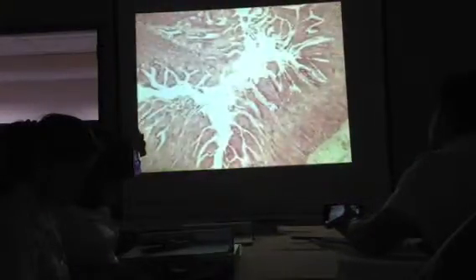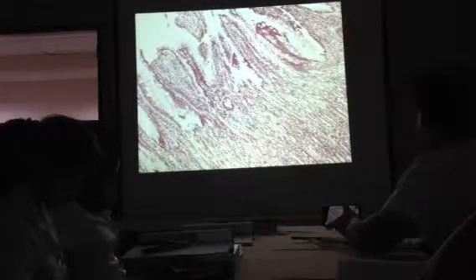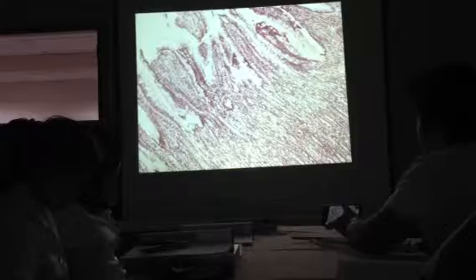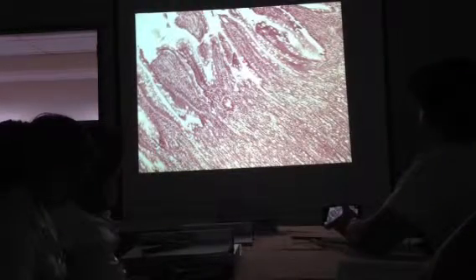Next slide. Duodenum. So, what we discussed earlier about the ileum, the same will be the features for the duodenum. So, identify the structure pointed. What type of epithelium?